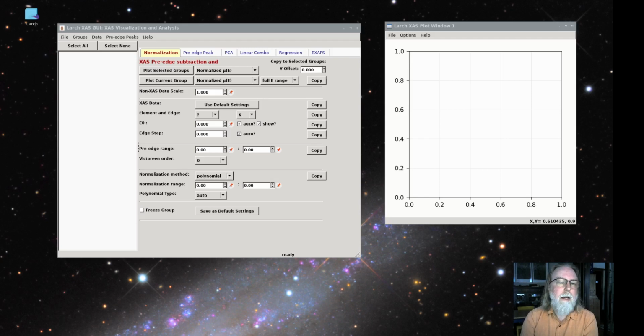environment. Here, we'll look at the pre-edge peaks of iron K-edges and analyze them to get the centroids of the two peaks in question. While many folks have done this over the years, this example follows the work of Elizabeth Cottrell and co-workers, who have carefully calibrated the centroids of iron pre-edge peaks in a variety of systems with Mössbauer results. The data I'll show here is from some of those kinds of studies, and I've mostly hidden the details of the actual samples, but if you're interested in following more of this sort of work, I highly recommend the work of Cottrell et al.